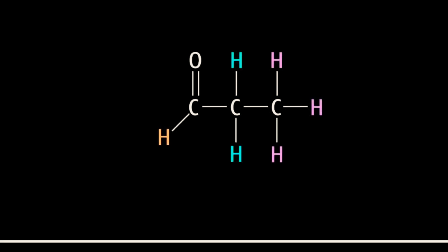And you can tell what I mean by environment. Look at this, the one on top. The one on top is bonded to a CH2, which is bonded to a CH2, which is bonded to a CHO. The one here is also bonded to a CH2, CH2, CHO. So that's why all these three have the same other sequence of atoms bonded to themselves. So these three are considered to be chemically equivalent or having the same environment.